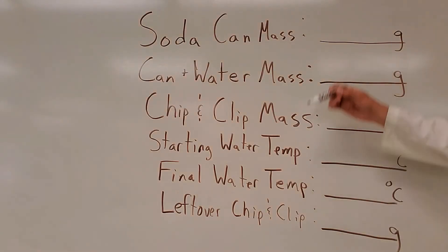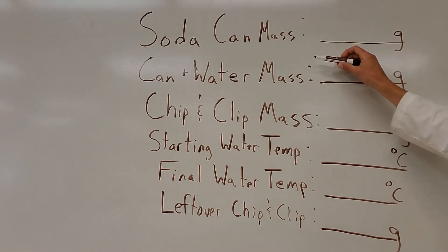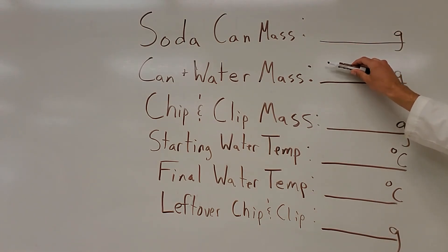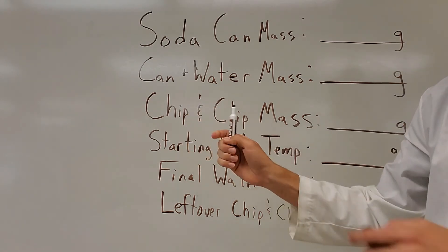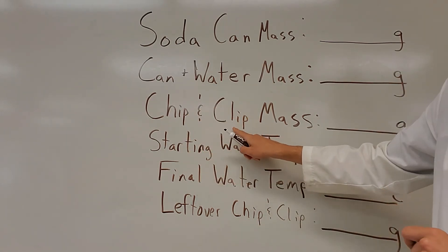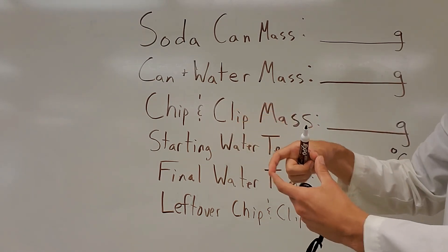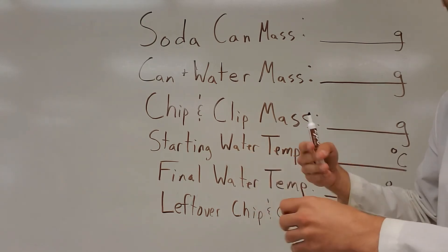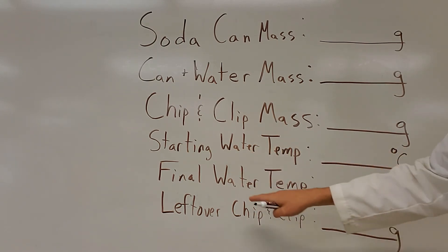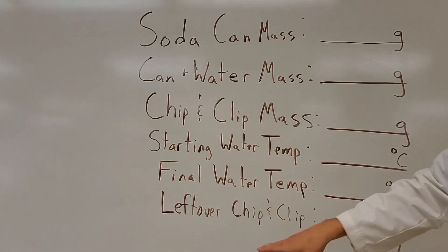Here are the measurements we're going to be taking: first, the initial soda can mass, then the mass after we add the water — both in grams. We're going to mass the chip and the paper clip. In my case I'll also add the watch glass. Then we take the initial temperature of the water, do the burning of the chip, and measure the final temperature to see how much it increased.